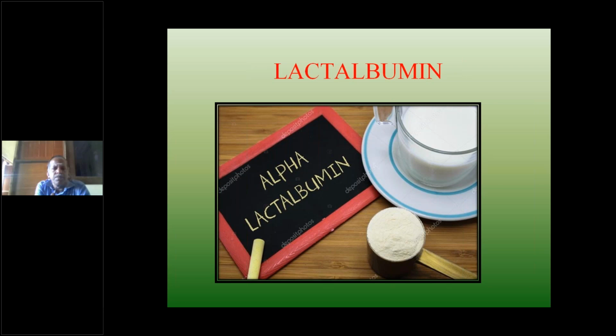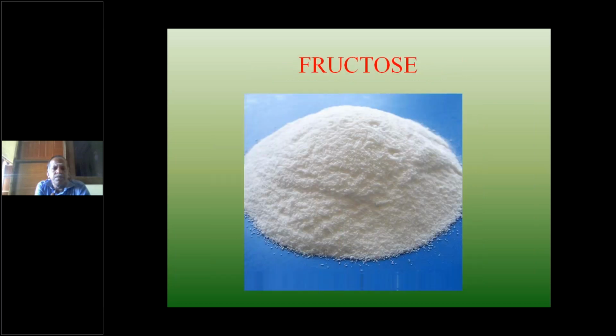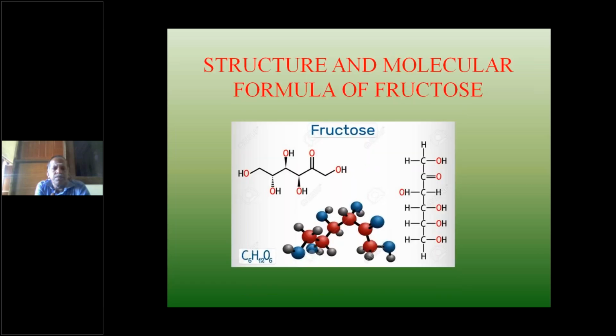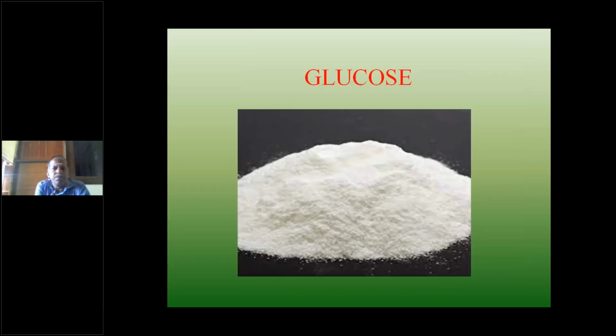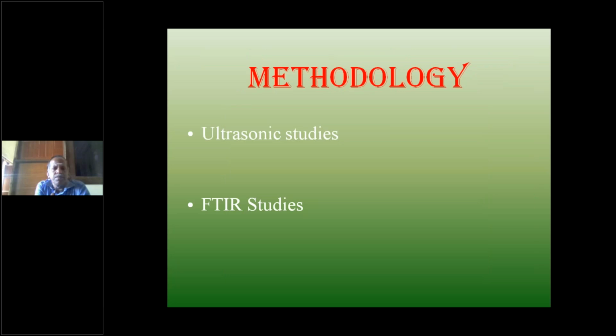So we have taken only these two proteins, and similarly the additives, we don't take any salt. We have taken only fructose and glucose. Both carbohydrates are almost similar in structure with a change in structural formula. One has a ketone group, and the other one has another group. And the methodology we use are the ultrasonic studies and the FTIR studies.